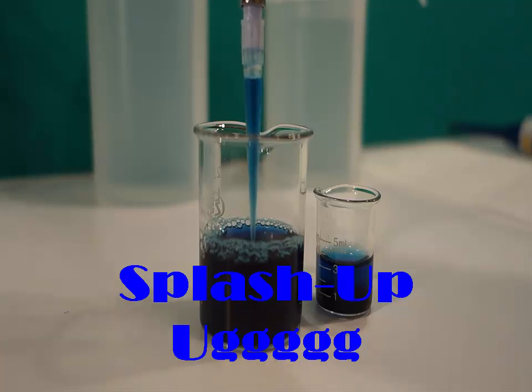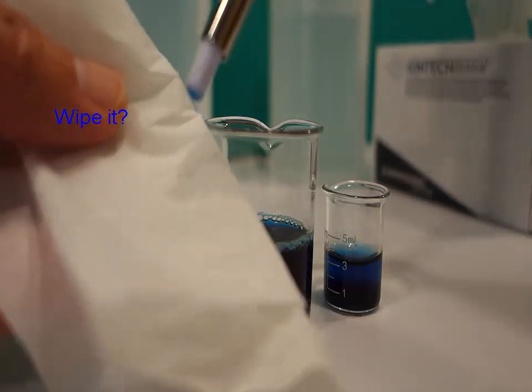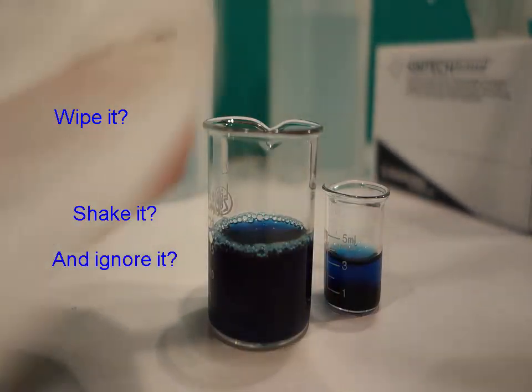Today's topic is splash-up. Does this happen in your lab? What do you do when it happens? Do you do this? Or maybe this?